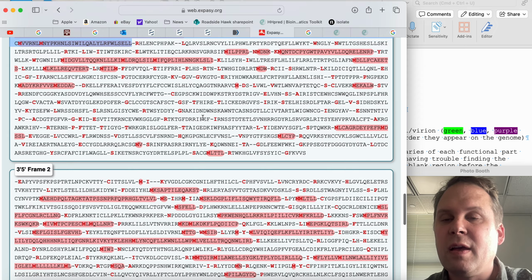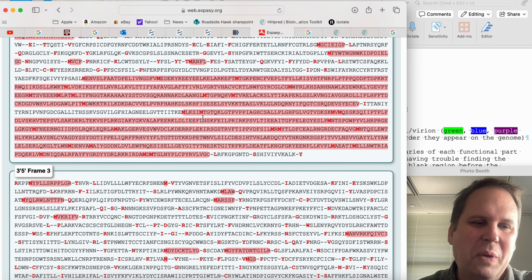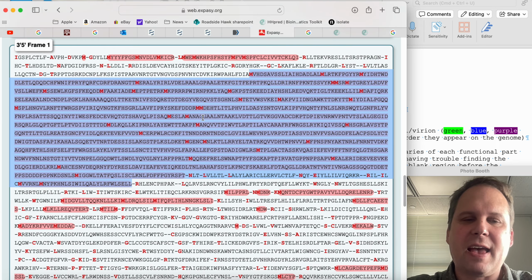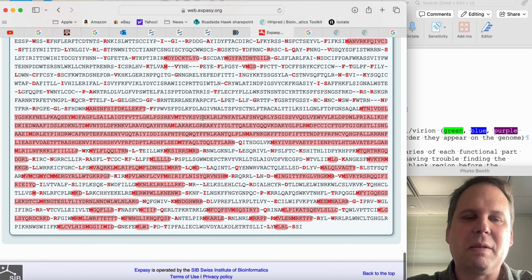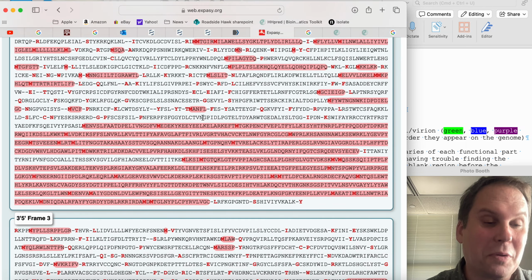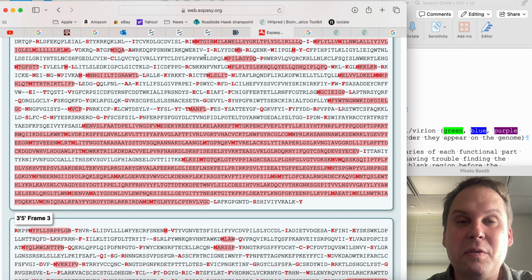You might have two. So there's the front half of it. And here, mine came out in 3 pieces. Weird, but viruses sometimes do that. And so I would take this piece, because it comes from the front, like the first half. And then I would take these 2 pieces, because they come from the second half. Oh, and there's the middle piece there. So first piece, second piece, third piece, fourth piece. I got a 4-piece virus. Wow. What did you get? Did you get a 1-piece virus? Yeah, that's lucky. That's convenient if you did. But yeah, these exist too.